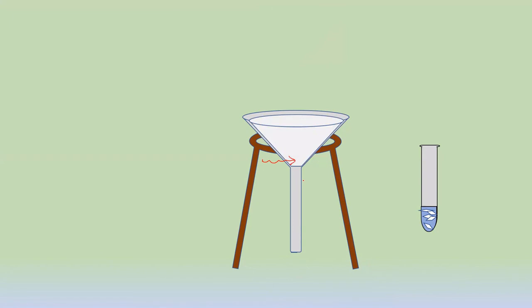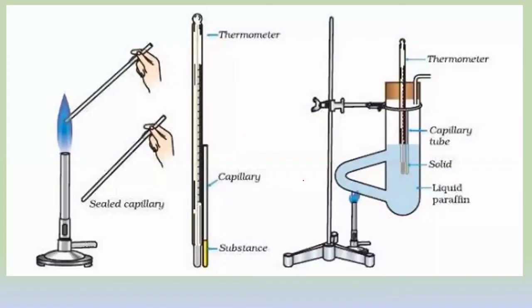Whether the purification is done perfectly or not, that we can determine with the help of melting point. So how you take the melting point, I've just taken a picture here because in the previous experiment also we have discussed this many times.